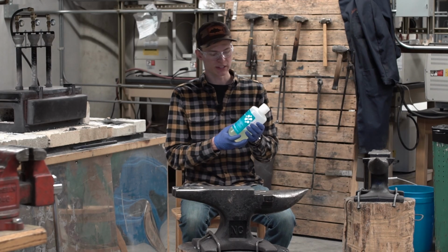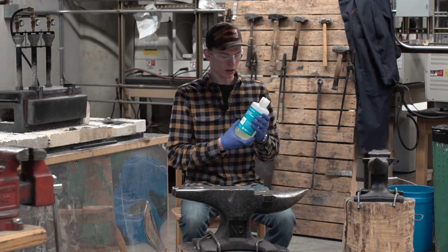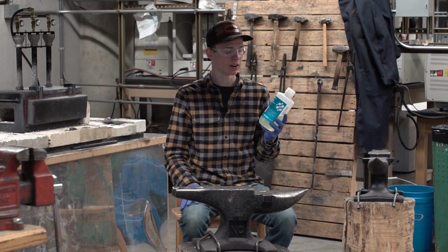Okay, so say you want to do dense media separation. Why would you choose sodium polytungstate over any other liquid? Well, for one thing, it's one of the heavier dense medias out there.